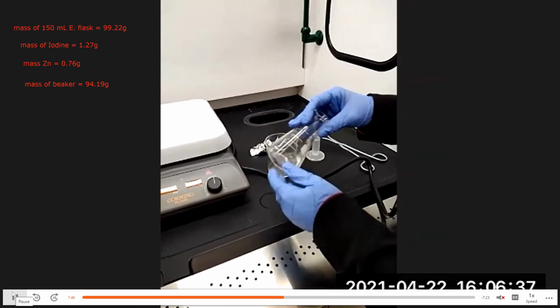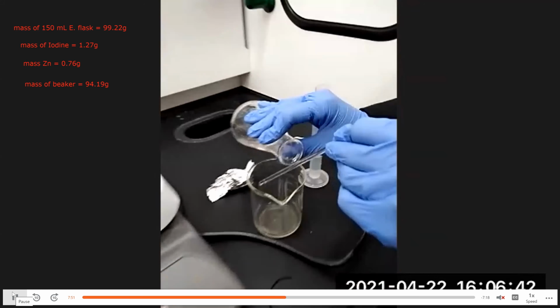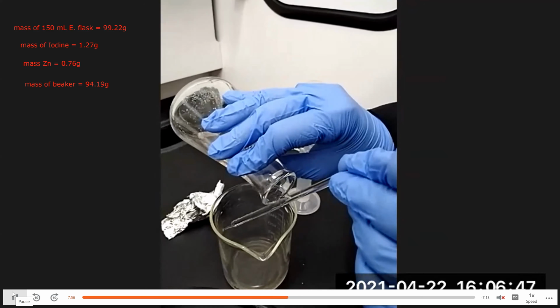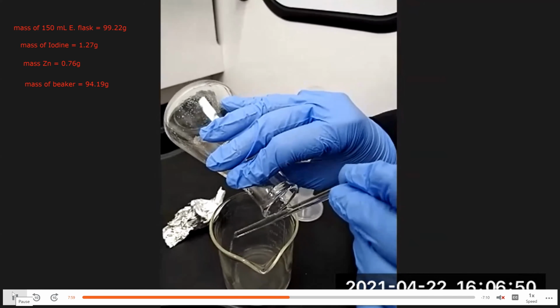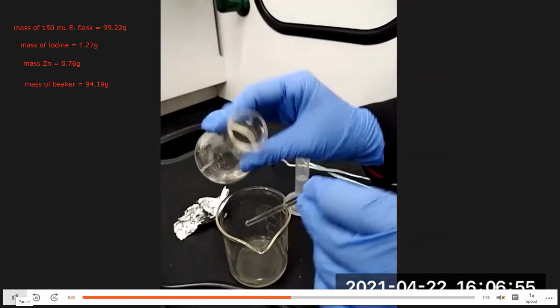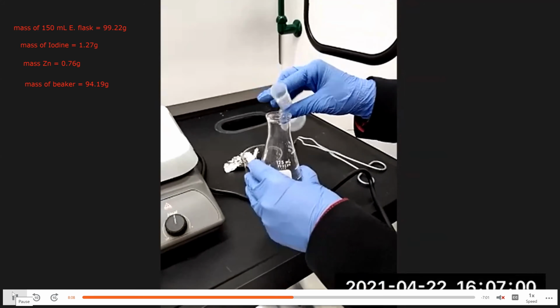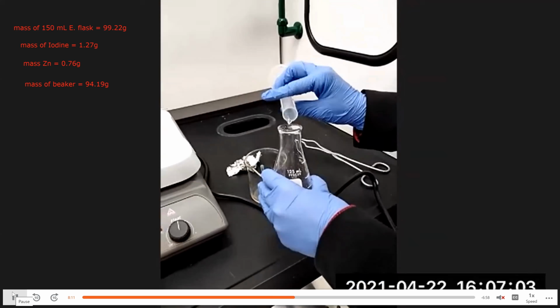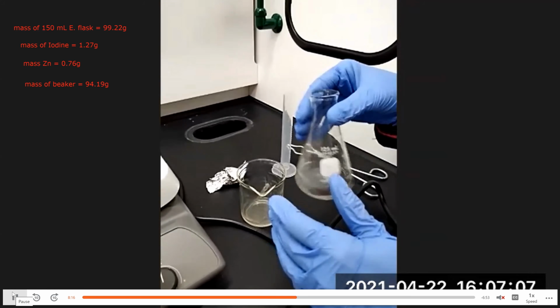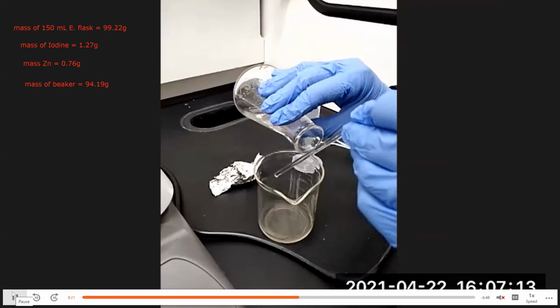Again, this is to remove any product that's still left in the Erlenmeyer flask. You're going to do 2 to 3 washings of about 5 milliliters of methanol, to make sure we get all the product out of the Erlenmeyer flask.